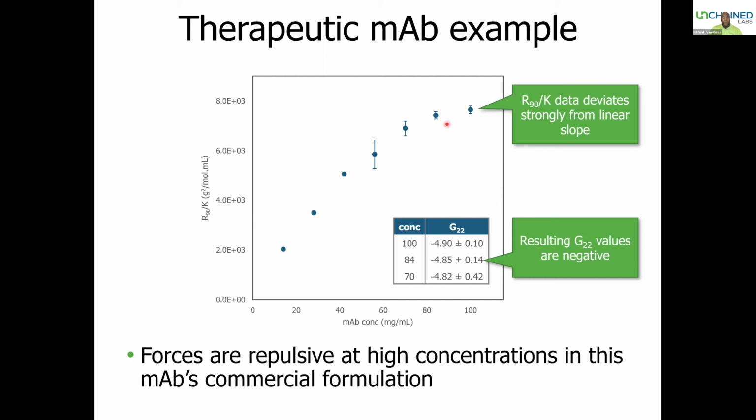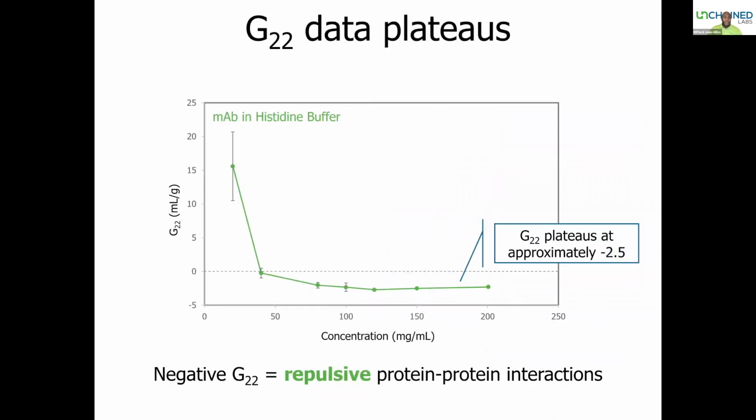And so at some point, the concentration dependence and stabilization that can happen begins to be a bit more apparent. And so if you're now able to look at that data converted from the intensity to the G22, what you're viewing here is a bit of a plateauing effect that can happen, right? And so as that sample begins to go up to a certain concentration, there isn't a drastic difference in the G22 value, which usually means for you that at some point, somewhere around here, there's no more added benefit, or certainly there's nothing worse happening, right, as you go there. So if your buffer is able to withstand it, then you're fine. If it's not, then certainly you have some wiggle room to find the right concentration.